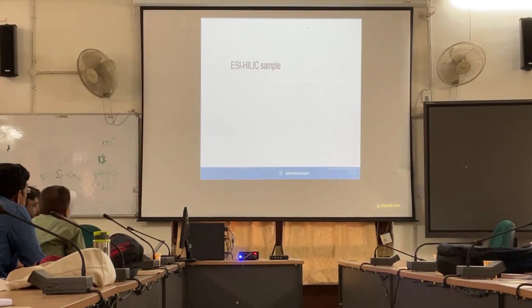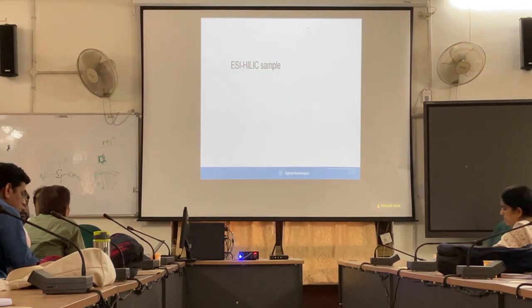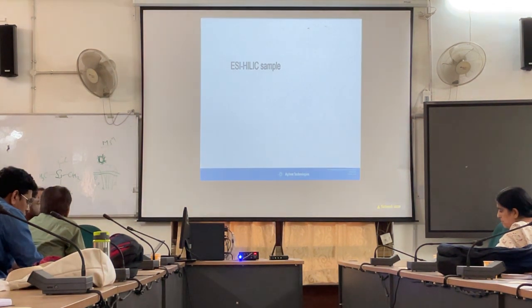Hydrophilic interaction liquid chromatography. What is the purpose of using HILIC? In reverse phase chromatography, it's like polar and non-polar both interactions would happen on the chromatography. So this is hydrophilic lipophilic interaction. Any mixture which is having hydrophilic, like polar, and lipophilic, like non-polar, components, interaction would be better in this process. How does reverse phase work? What is the mode of interaction in reverse phase?